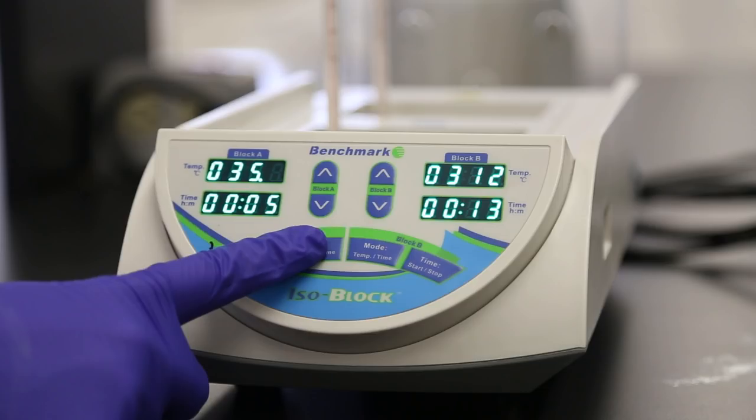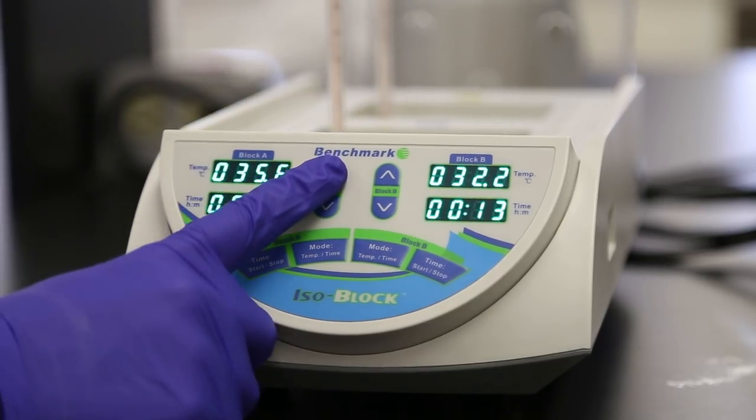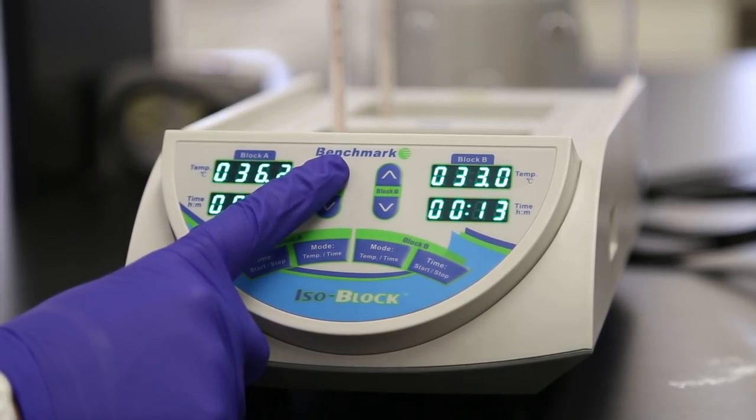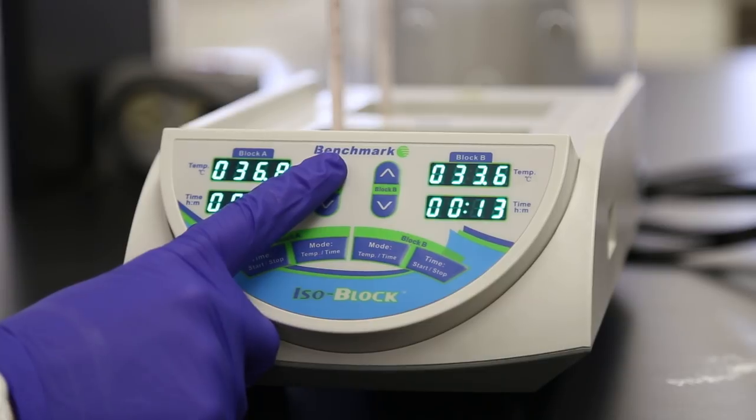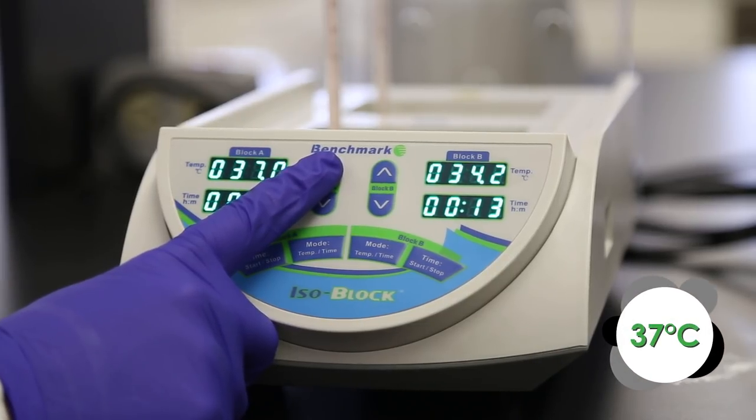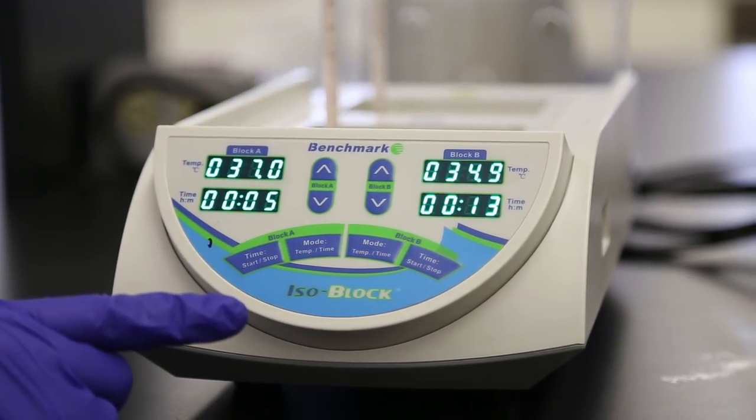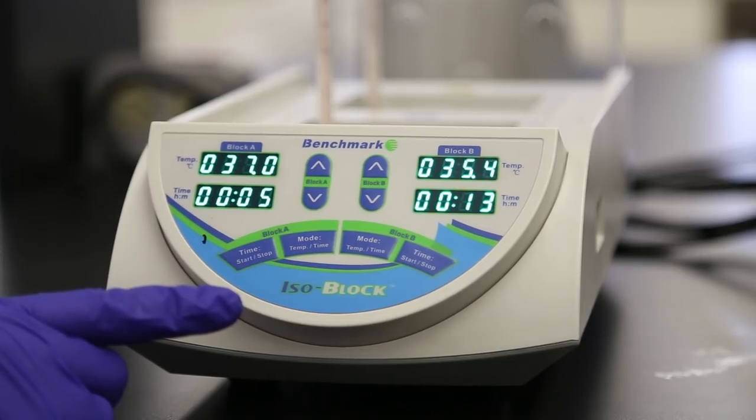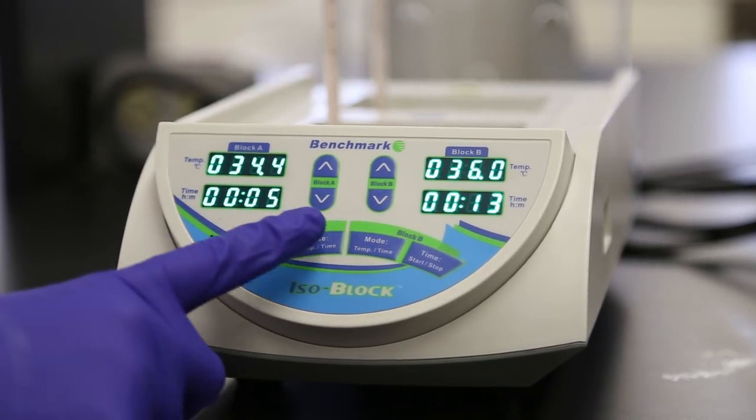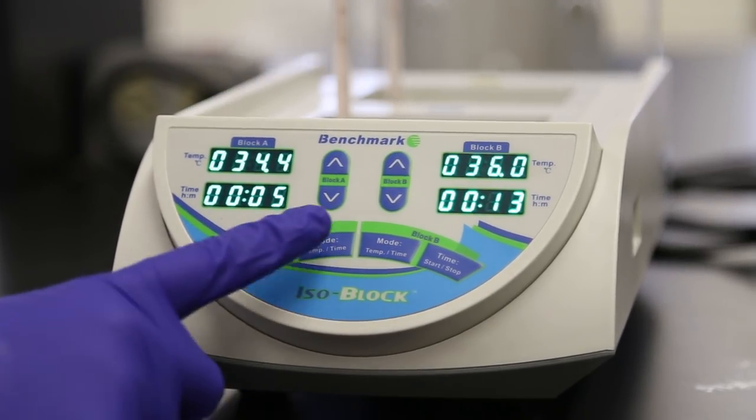The last digit of the temperatures display flashes indicating the selected field. Using the Block A arrow keys, press and hold up or down to adjust the temperature setting to 37 degrees Celsius. Holding down the button adjusts the setting temperature faster. The block immediately starts heating. To use the built-in timer, press Mode Temp Time for Block A twice to select the time setting.